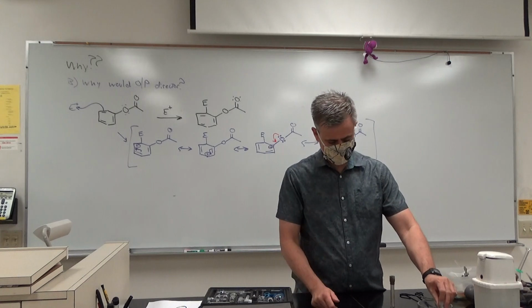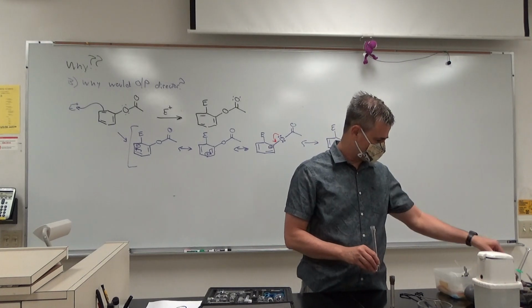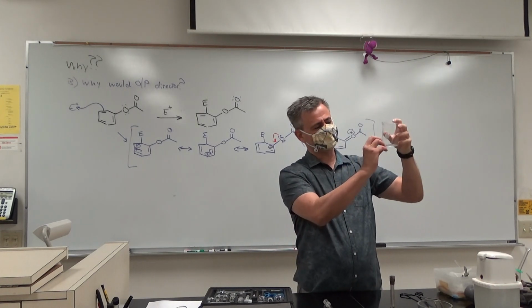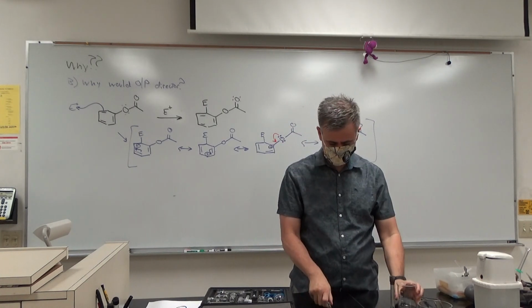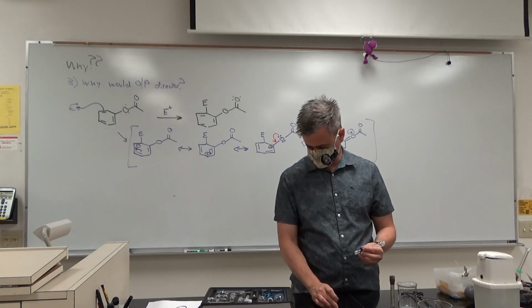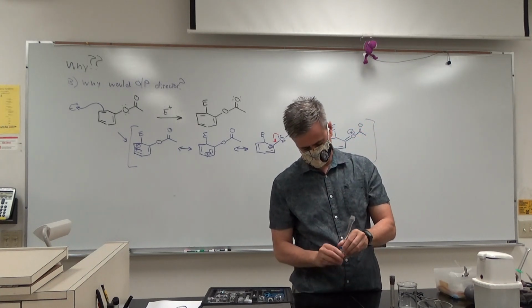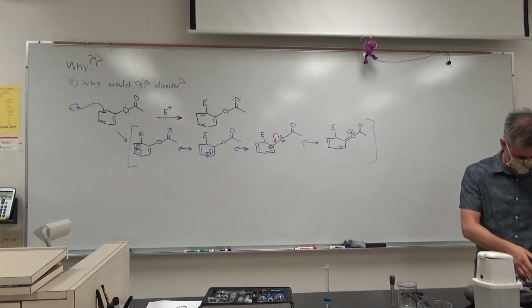For the reaction, you're going to use your 250 for an ice bath, okay? Only make this about an inch high. Only an inch high. Don't forget the blue nut and then the O-ring, okay? Maybe I'll just show you this setup real fast. That might be a good idea.